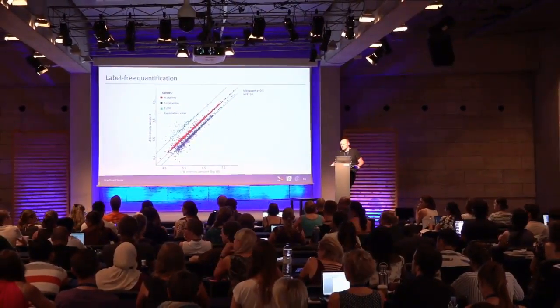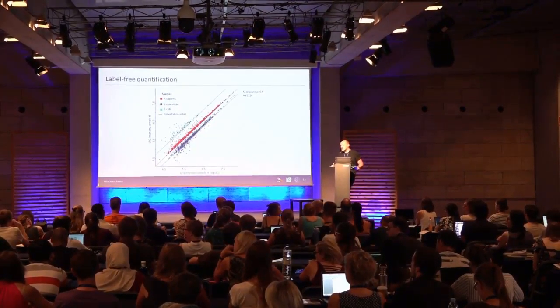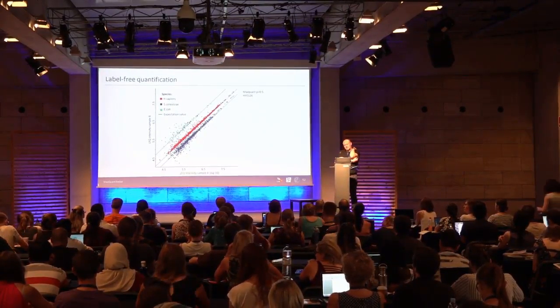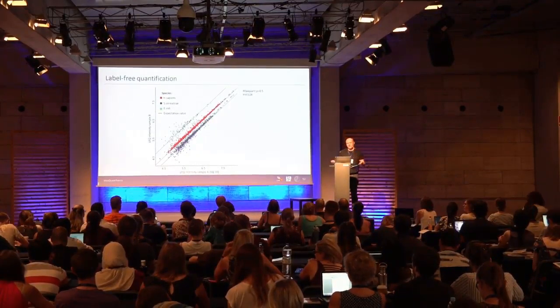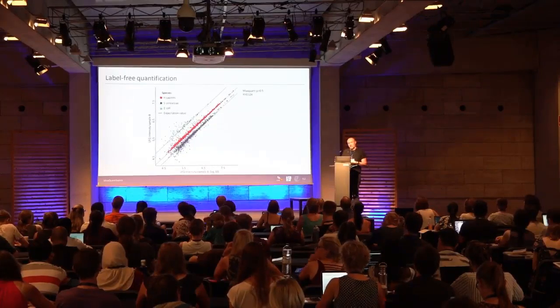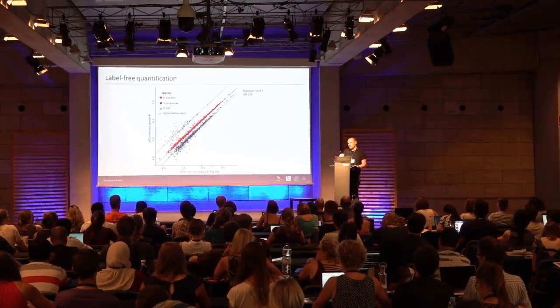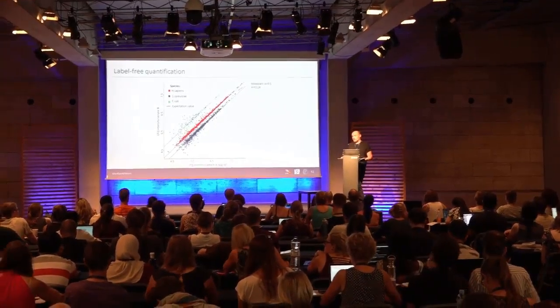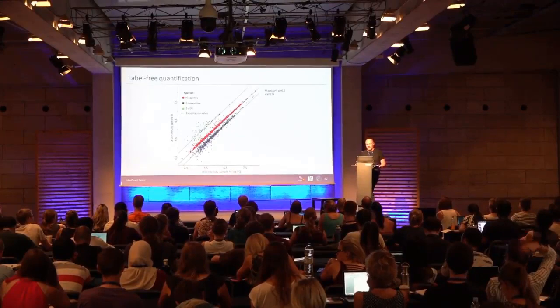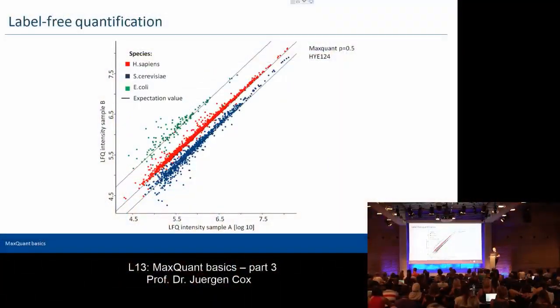I have a question concerning the TMT label. Is this only possible with a 6-plex label on timsTOF, or also 10-plex and 11-plex? No, it's only 6-plex because the resolution at low mass is not enough on a TOF. TOF and Orbitrap have different characteristics in the resolution. The resolution depends on the mass: it is more or less constant for a TOF machine, and decreasing for an Orbitrap-like machine. So you have slightly lower resolution at the low mass where the reporters are sitting.